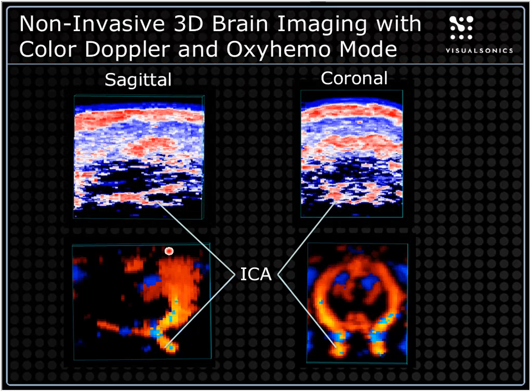Whereas we may not be quite sensitive to the blood flow up here, it may be too slow or too weak to detect via Doppler, we can certainly see the blood with photoacoustics, since it doesn't rely on the flow of blood, and we can detect oxygenation in the cortex and then subcortical structures right down here into the lower parts of the brain.